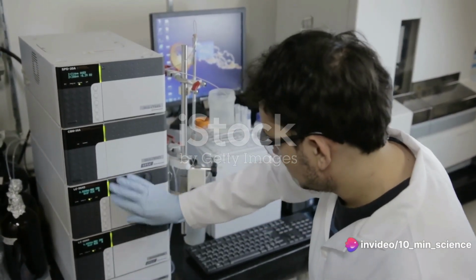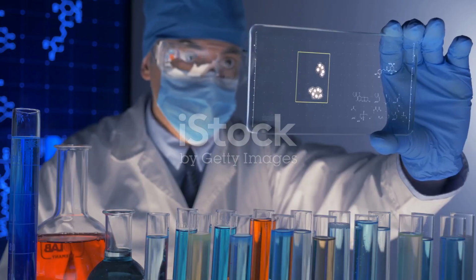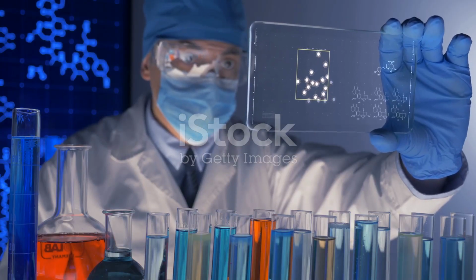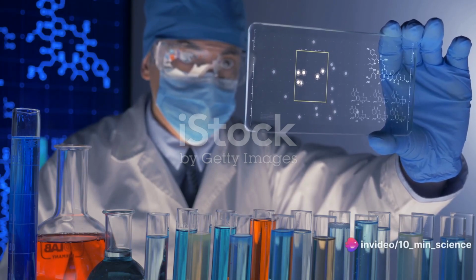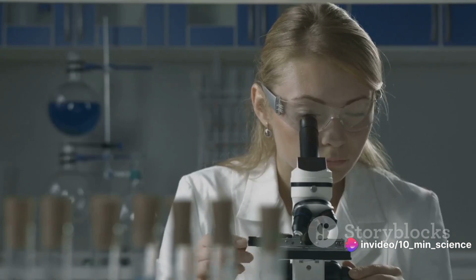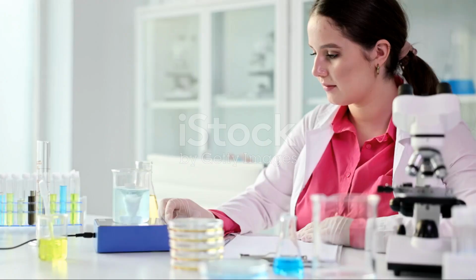It's like a pre-flight check for a pilot, ensuring all systems are go before takeoff. This crucial step is carried out before any actual sample analysis. It's an integral part of the quality assurance process, assuring us that the chromatographic system is operating correctly. It also verifies that the method's performance is consistent with what was established during validation.